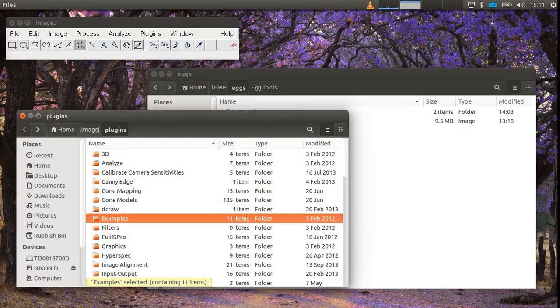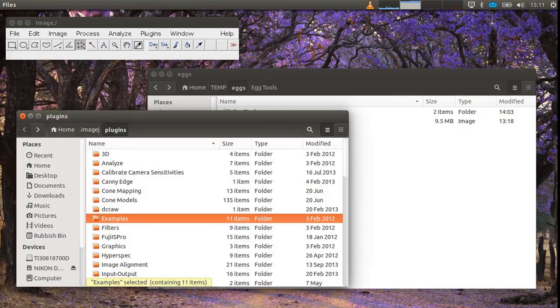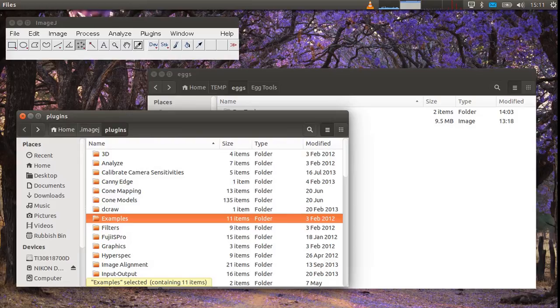In Linux your ImageJ plugins directory will be somewhere like this, home imagej plugins. In Windows it will be in program files imagej plugins.